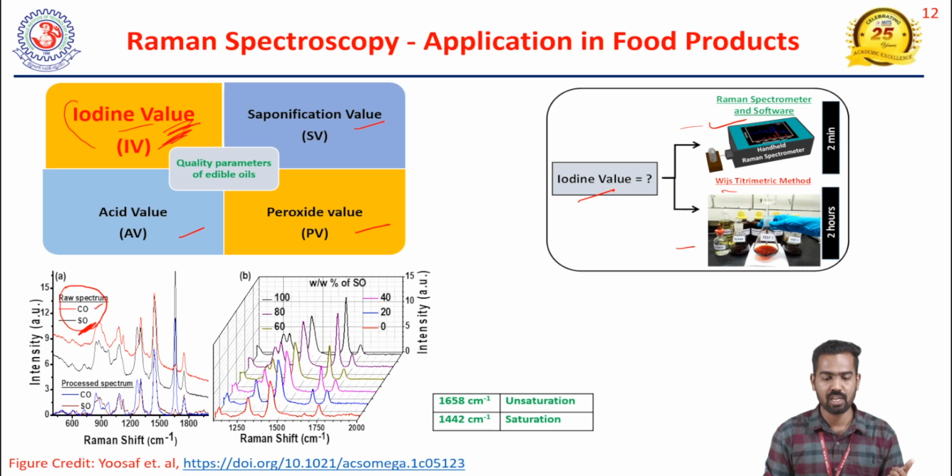That is also fine. In the same way, some oils like gingerly oil and palm oil have an iodine value between 10 and 150, so we can analyze those types of edible oils also. Using this method, around 20 edible oils were analyzed. So what is the main thing?